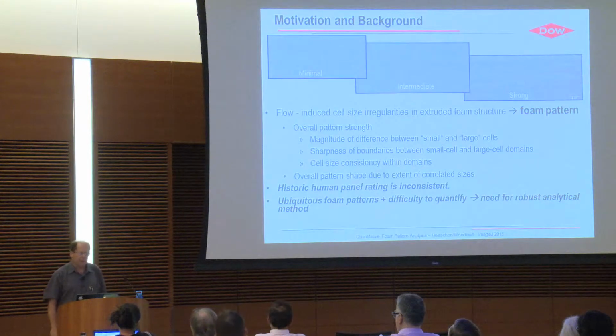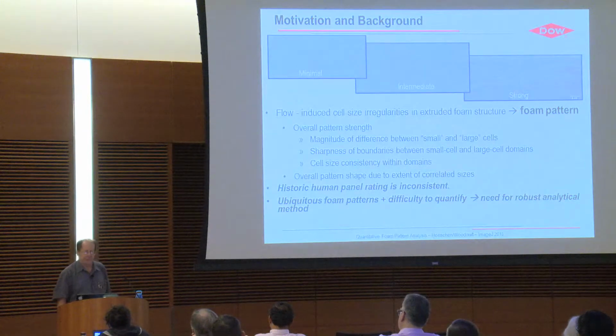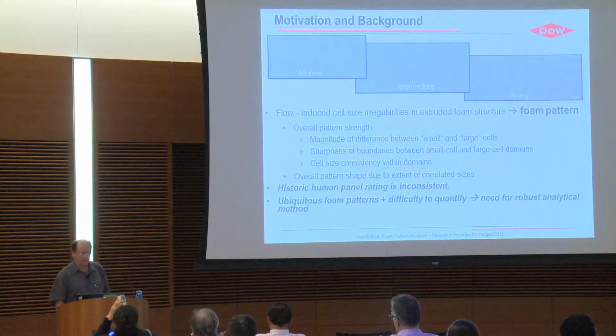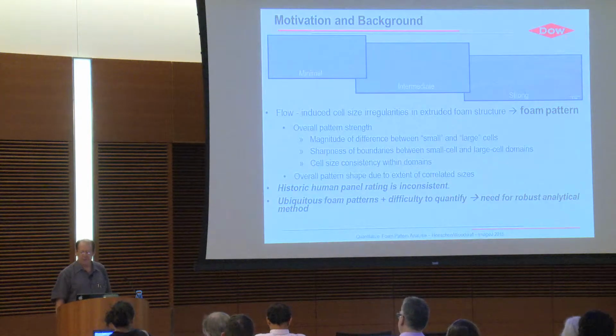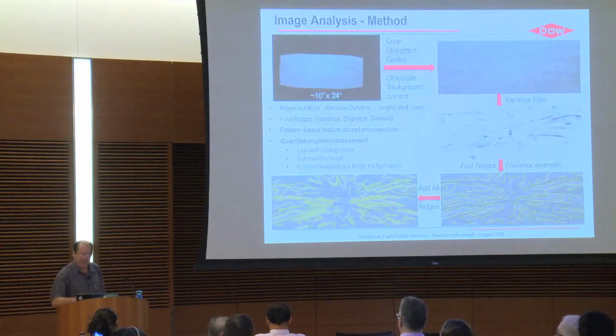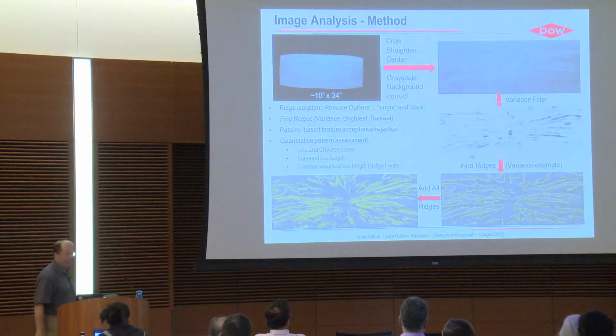Anyone who's been involved in panel ratings knows that they're nasty. You have to have well-trained panelists who are very diligent about ranking what they're looking at, and even then you don't generally get really good consistency out of them. We use this as part of our ongoing production system to watch how these foams are being made, and as long as they look like that one, we're happy. But they don't always. So we end up having to check the pattern.